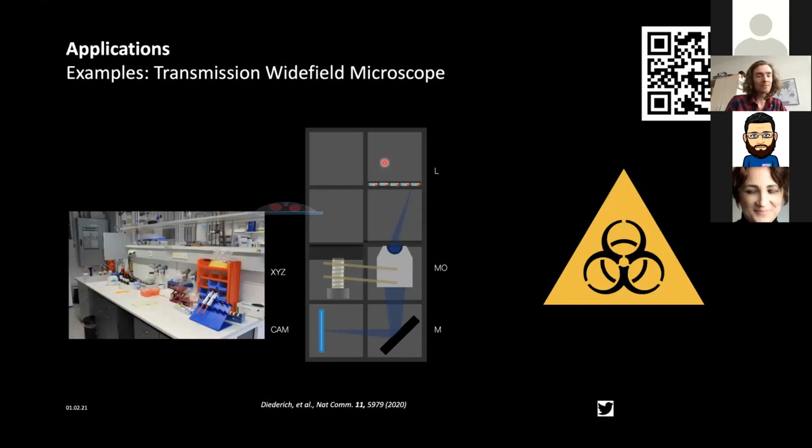It can get dirty because it's all plastic and 3D printed. It's very low cost because it's basically just based on stuff you could buy from any resource like Amazon or eBay, without making any advertisement there. And once it's done, eventually it can also be recycled. So that's all what, well, the biologists wanted to have in the first place.